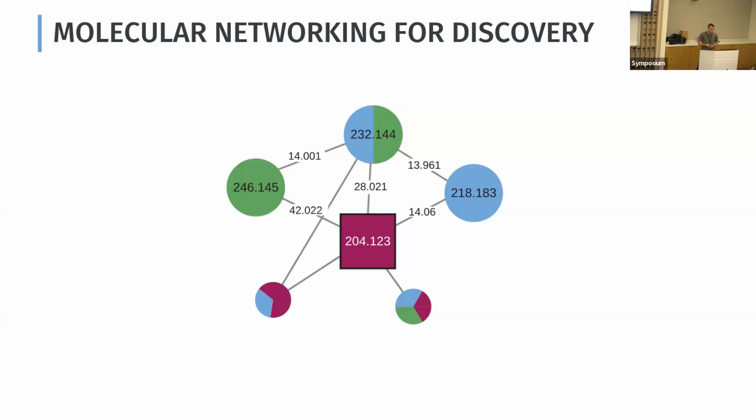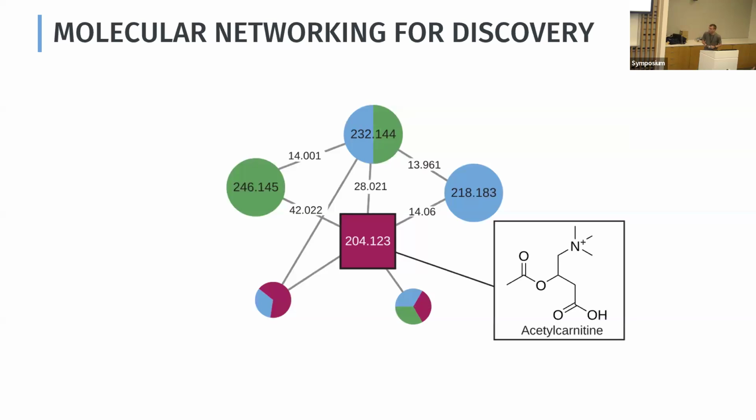One of the projects that I started in Pieter's lab was the nearest neighbor suspect spectral library. So this was published late last year, but it has been around for a little while, so you might be familiar with it. For the people that aren't, I'll give a brief introduction. We start from molecular networking, and in molecular networking, all of these nodes correspond to individual MS/MS spectra. They're annotated with their precursor m/z, and the edges between the different nodes are also annotated with their precursor mass differences. Now here, the square node indicates that this spectrum could be annotated using spectral library searching.